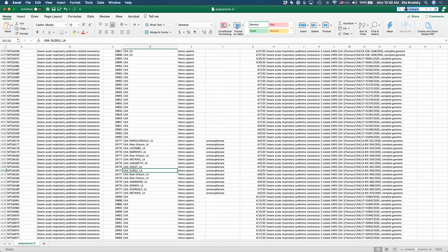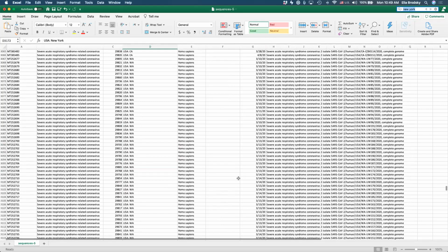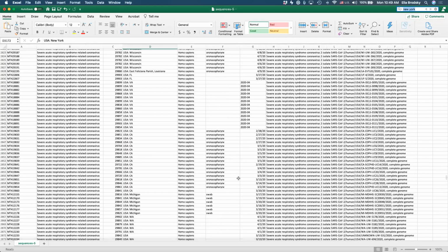Let's look for New York. Okay, so here's some in New York. Okay, so now you can search for different locations. How do you take samples?